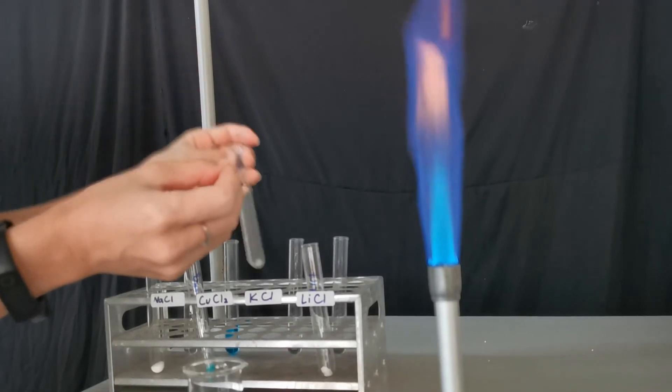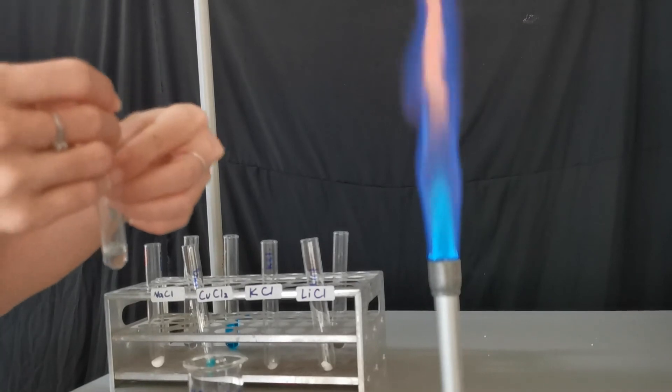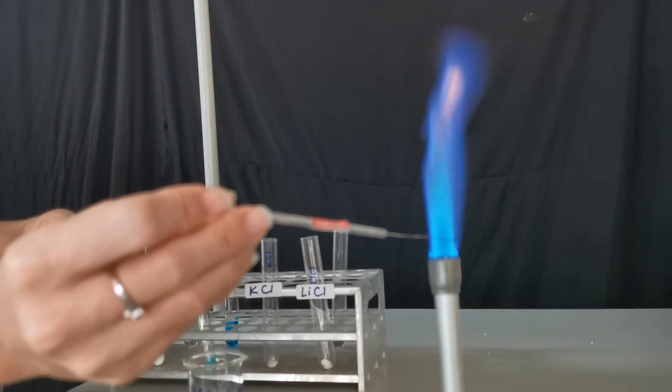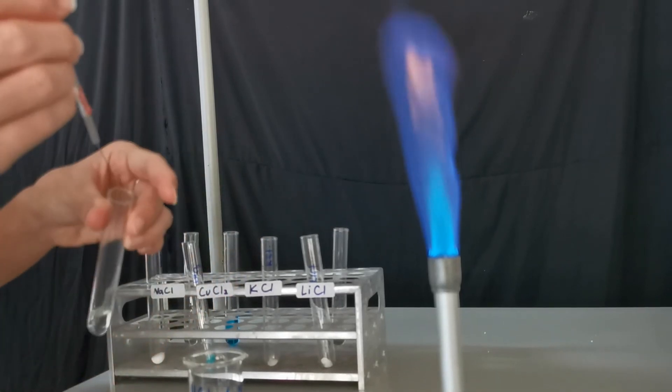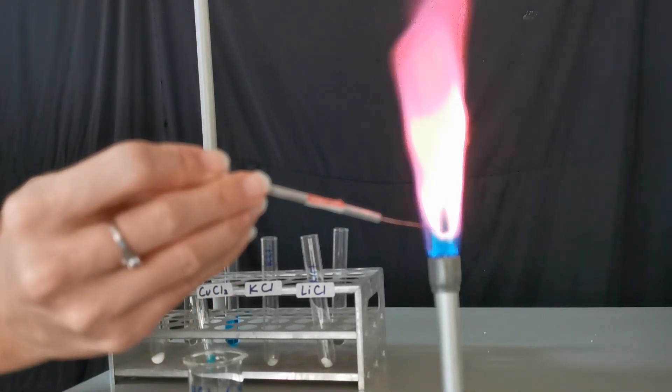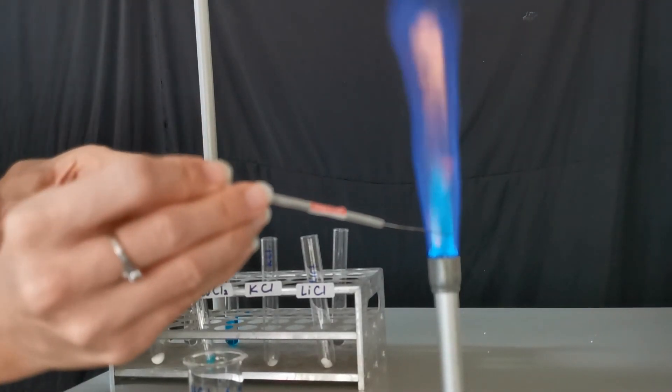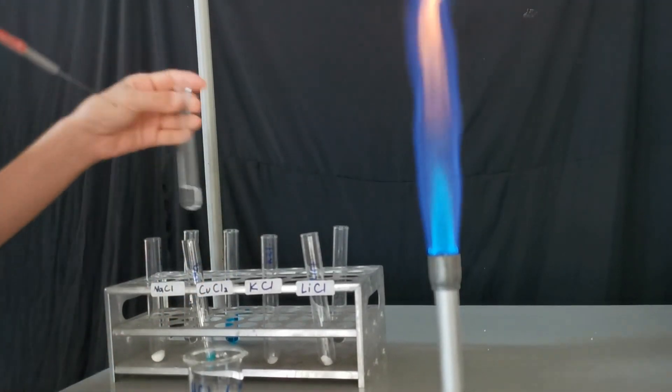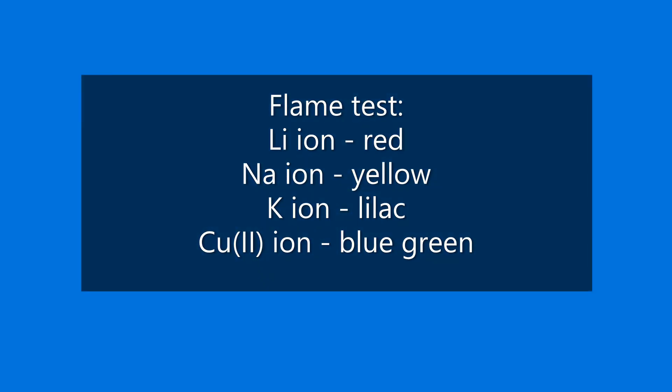Let me do that again. I'll repeat it with a solution this time. This lilac color. It's got a tinge of pink color.